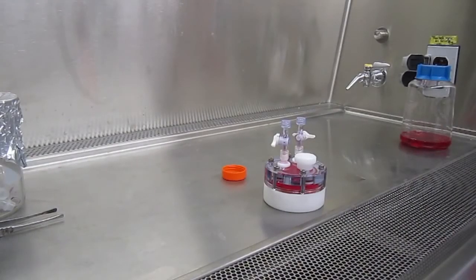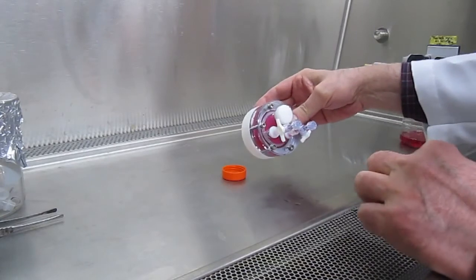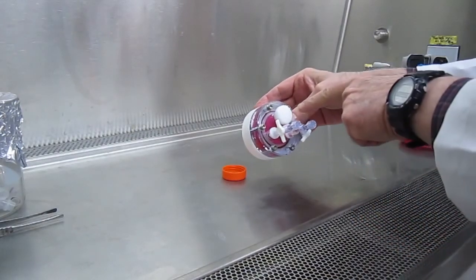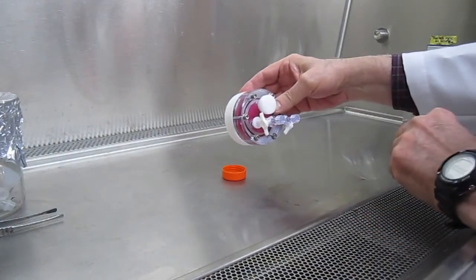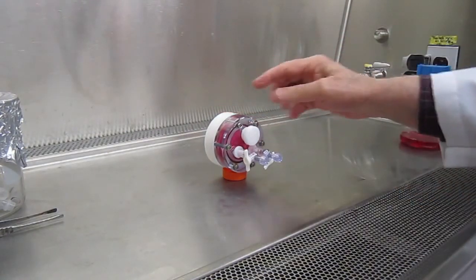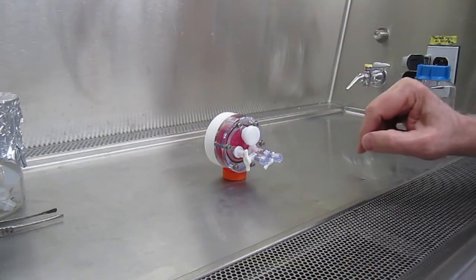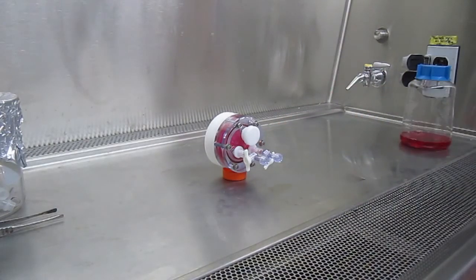There's a different procedure for changing the media in the HARV vessel. In this case, you tip the HARV on its side so that the large fill port is facing upwards and allow it to sit and the cells will sediment to the bottom on the opposite side of the fill port. This could take three to five minutes.